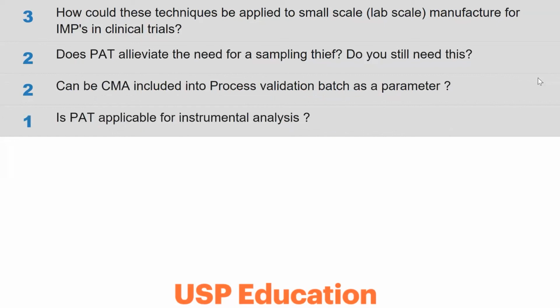Does PAT alleviate the need for a sampling thief? Hopefully not. A sampling thief, of course, is just a way to take samples from the top, middle, and end of a blend, throughout some sort of cross-sectional area.